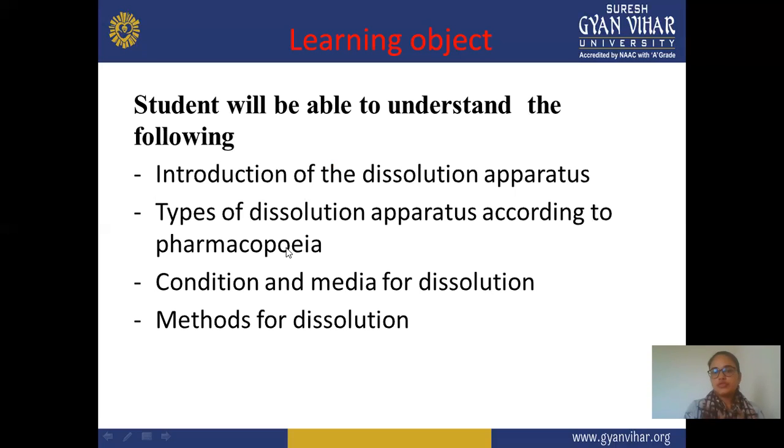Next is the types of dissolution apparatus according to pharmacopoeia. There are different dissolution apparatus available according to pharmacopoeia. You should know how many types of apparatus are available according to each particular pharmacopoeia, according to USP, IP, and BP, and their names and procedures, and how you use that particular apparatus.